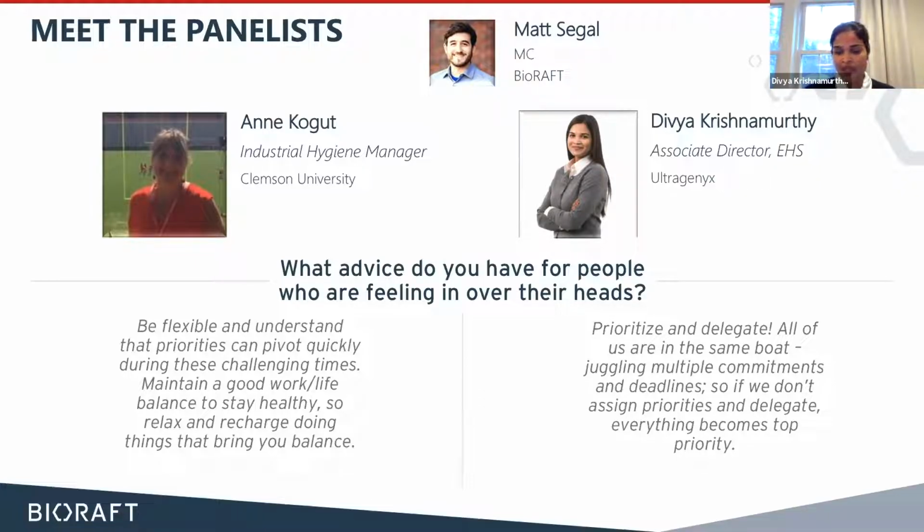Right now, with the challenge of space, and also when you have critical work going on, it's challenging convincing people that this is a task that needs to get done. Part of that, which we touched on earlier, was justifying why it needed to be done. So the way we approached it was to focus on the labs that needed it the most. Which ones are our high chemical volumes that we need to tackle first? Then we work our way down to the lower risk areas in terms of chemical loading.